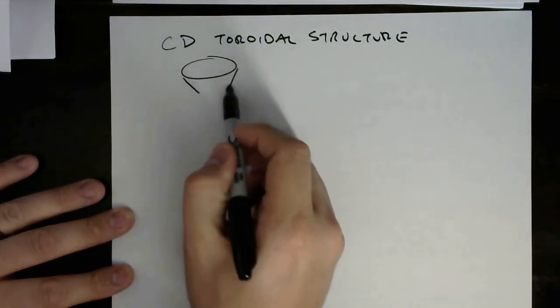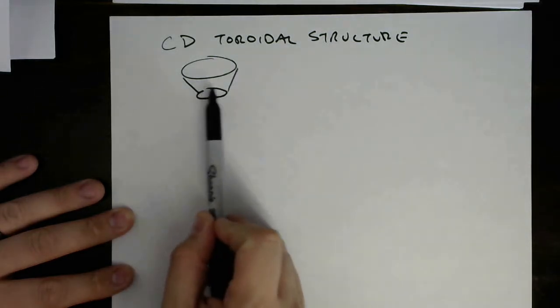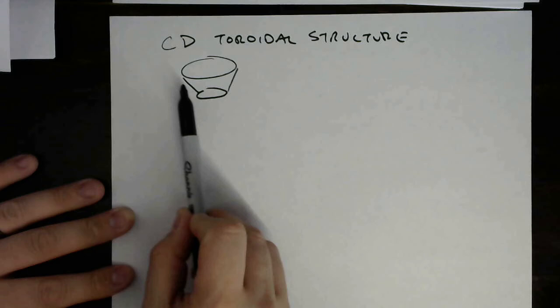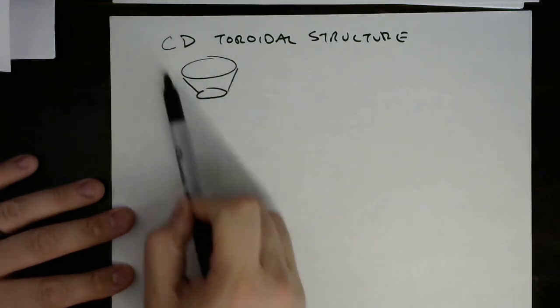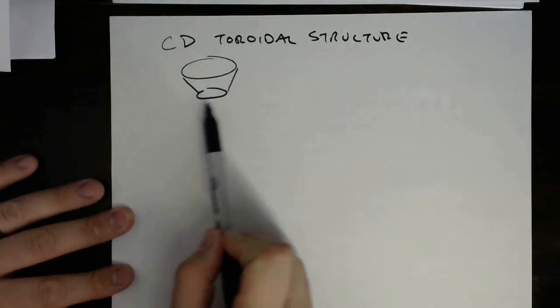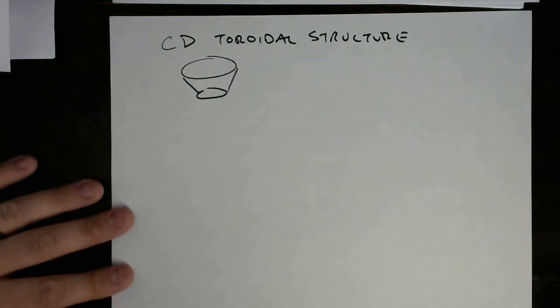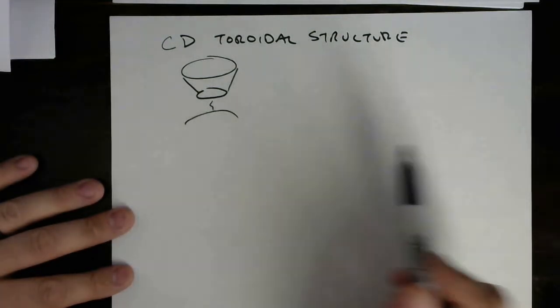We're just basically going to show the space that these things fill. So you can imagine basically this cone or funnel shape, the walls being lined with those D-glucose that are cyclizing, and they have a big open end where things are going to be able to bind in, and a smaller end where this thing's going to be tethered to a stationary phase particle.